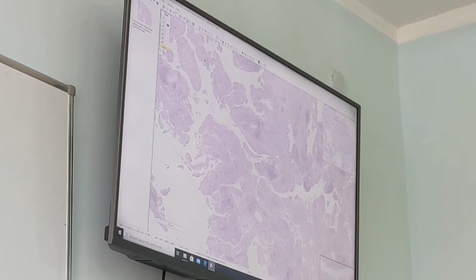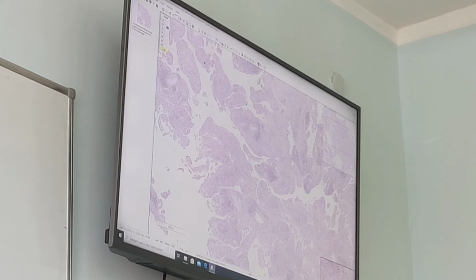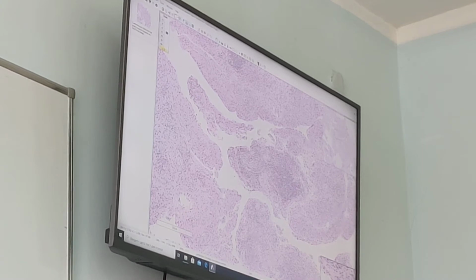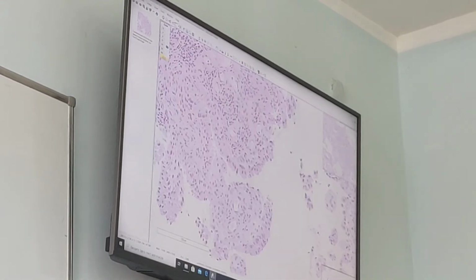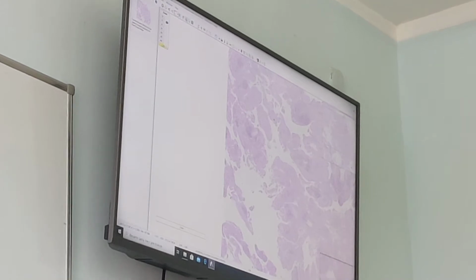Synovial membrane in rheumatoid arthritis. Sir, which one is normal for synovial membrane? They will not have more nuclei. Synovial membrane usually contains only a not very large amount of synovial cells. In case of hyperplasia, we can see that the number of synovial cells is increased. Due to this, some papillary-like structures can be seen.